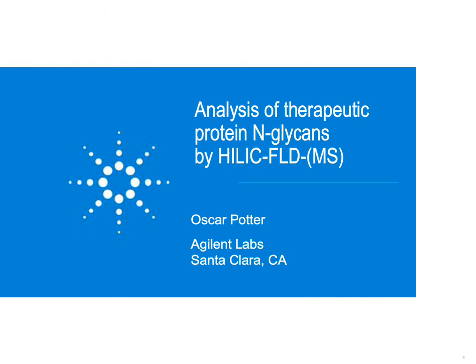In this part of the presentation, I will give a brief background on N-glycan analysis by hydrophilic interaction chromatography. My colleagues will then follow with more detailed information on sample preparation and analysis.